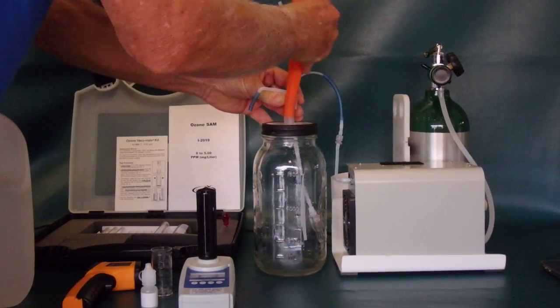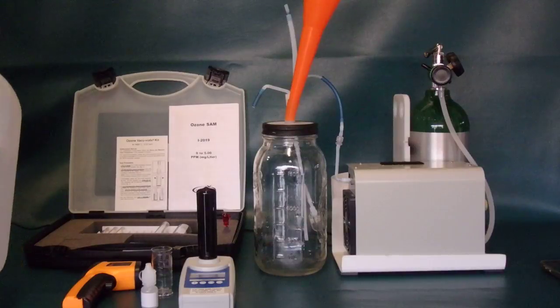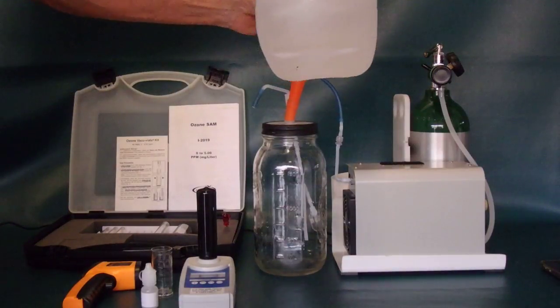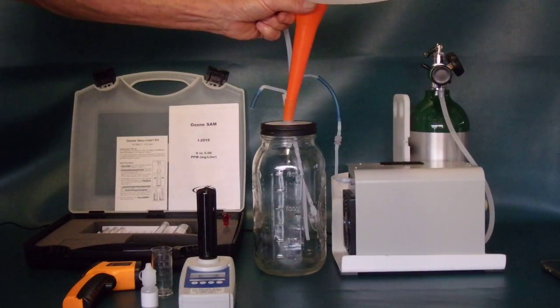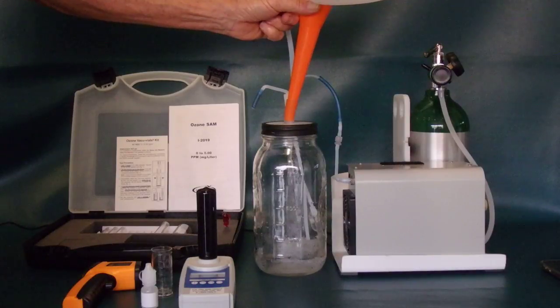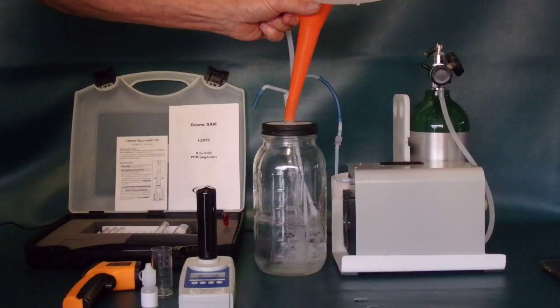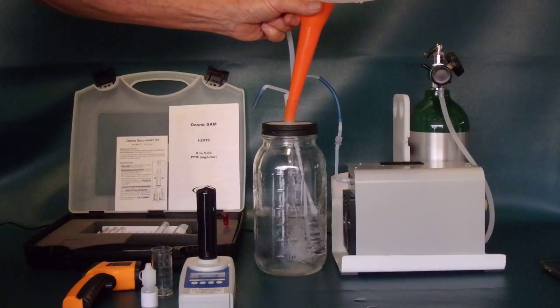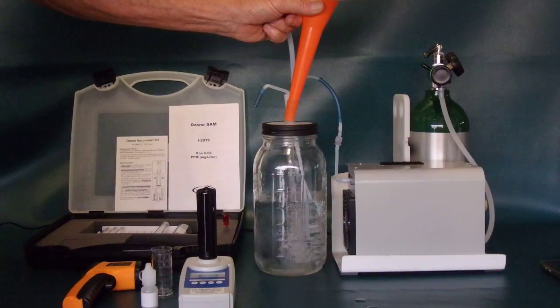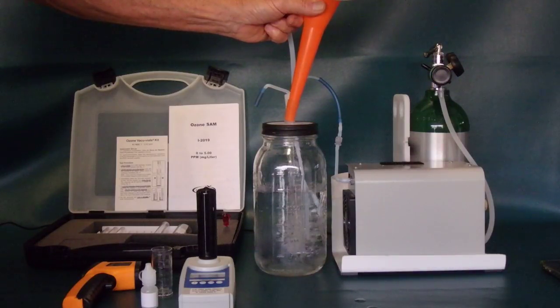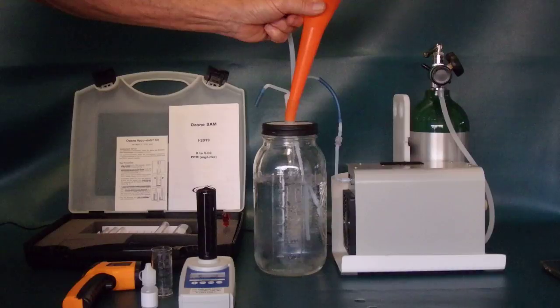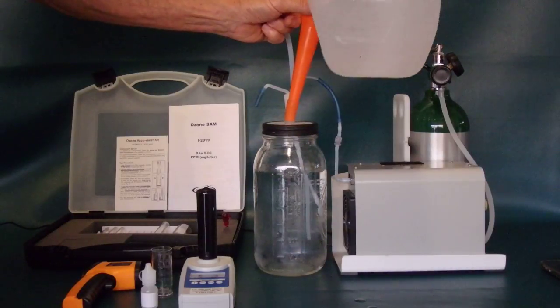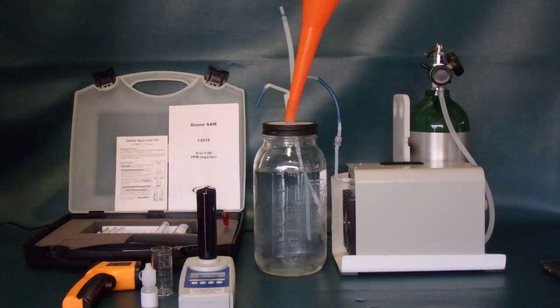We're going to be testing with the Kemetrix SAM system that goes 0 to 5 parts per million. Now since we expect to have greater than 5 parts per million, we're going to have to dilute it 4 to 1. But for now let's just put our water in the system here. Let's put in a full half gallon.